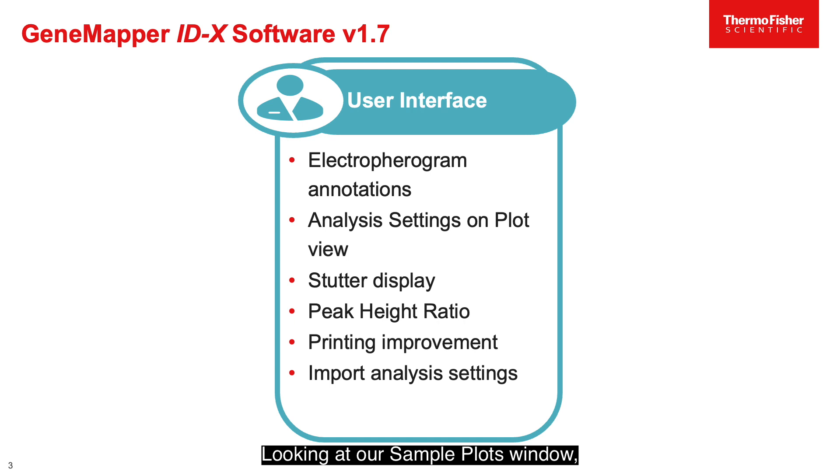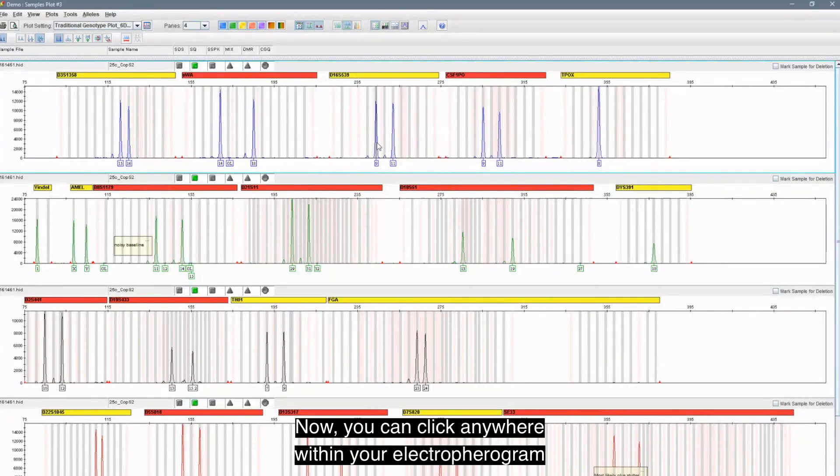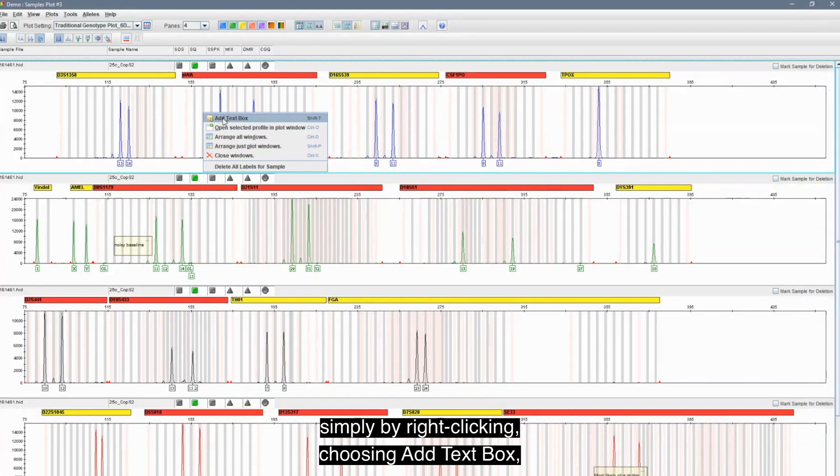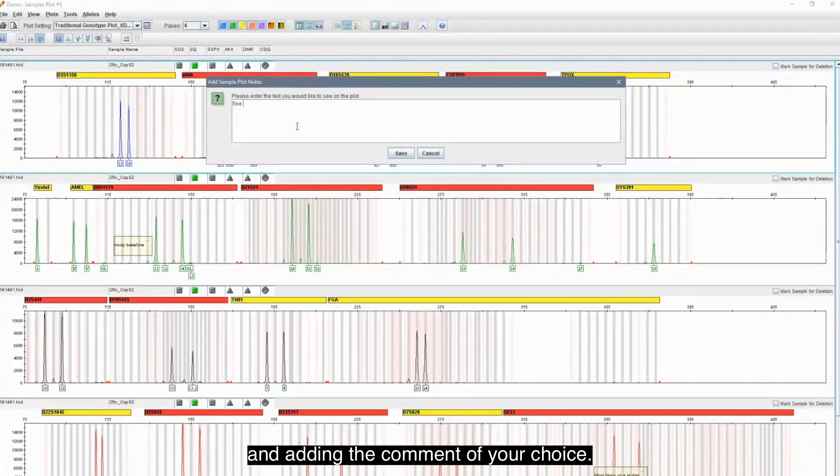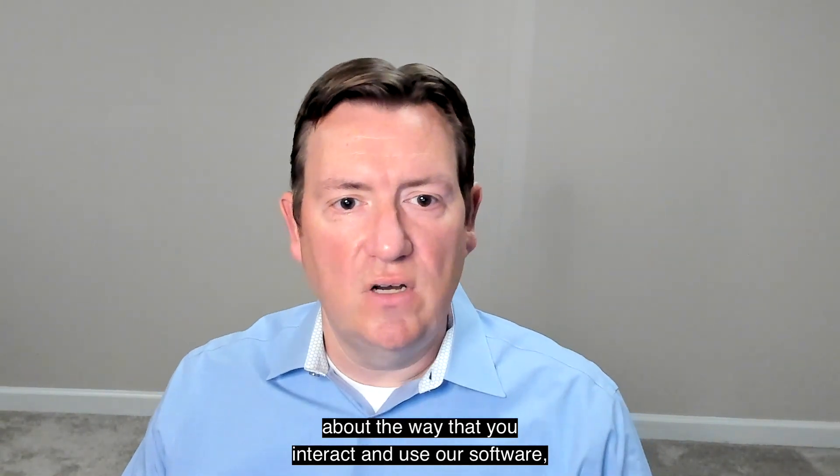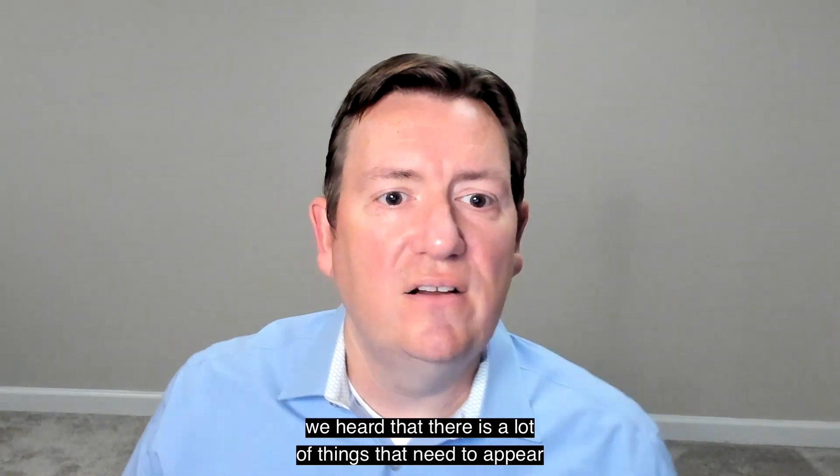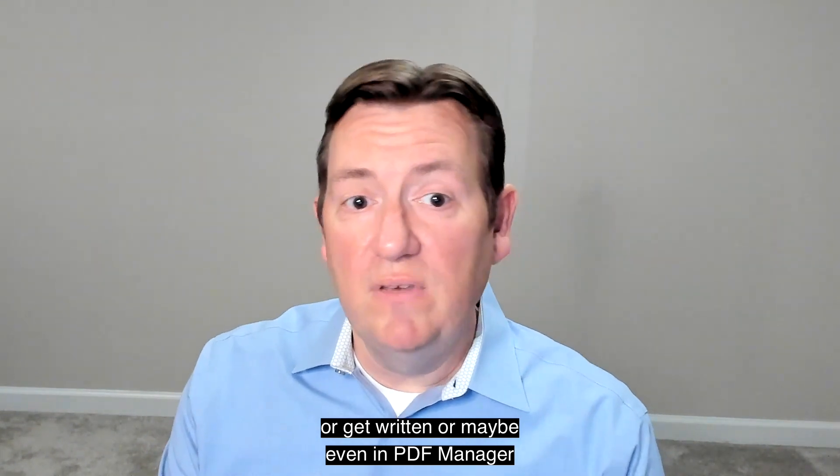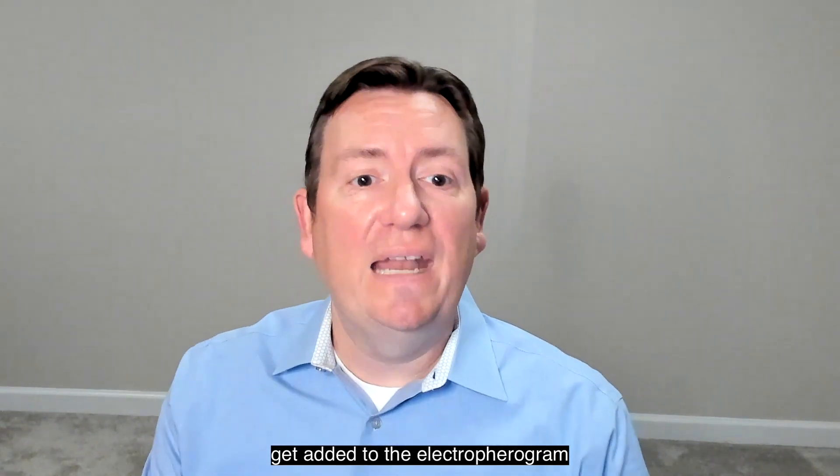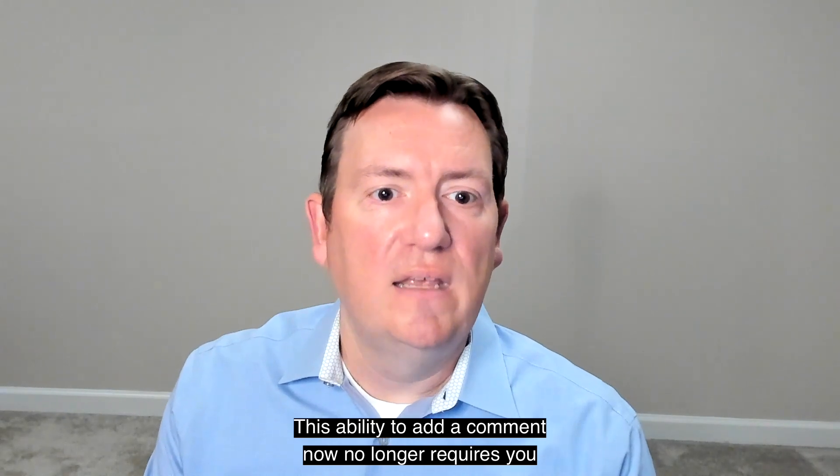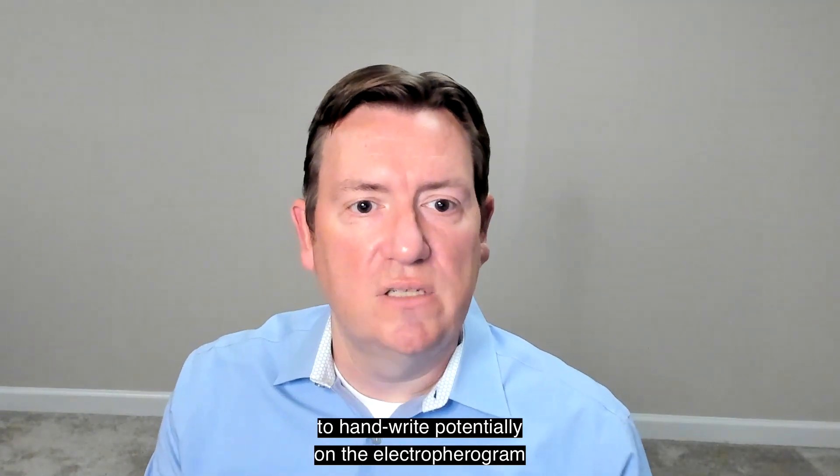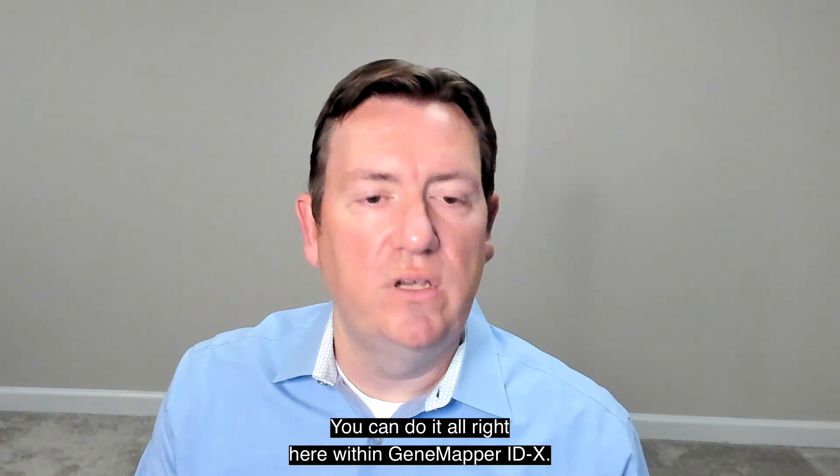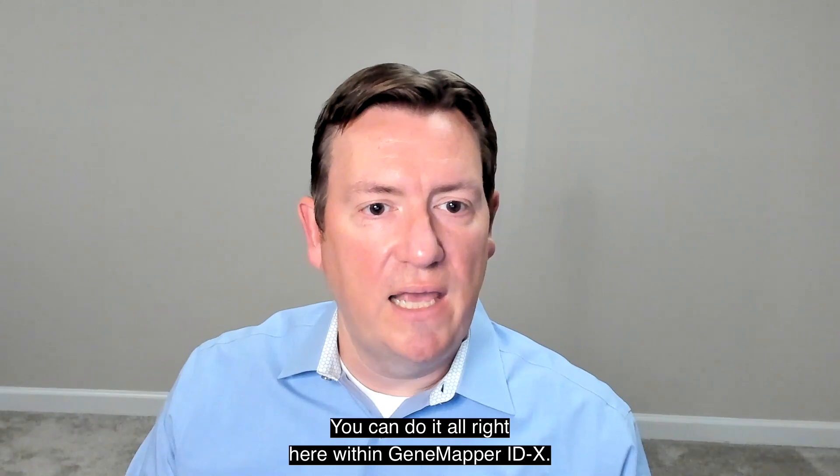Looking at our sample plots window, right away your eyes might be drawn to the new comments feature that we have. Now, you can click anywhere within your Electropherogram and add these comments, simply by right clicking, choosing add text box, and adding the comment of your choice. While talking with you, our users, about the way that you interact and use our software, we heard that there is a lot of things that need to appear or get written or maybe even in PDF Manager get added to the Electropherogram after annotation in GeneMapper IDX. This ability to add a comment now no longer requires you to handwrite eventually on the Electropherogram or take it to another piece of software. You can do it all right here within GeneMapper IDX.